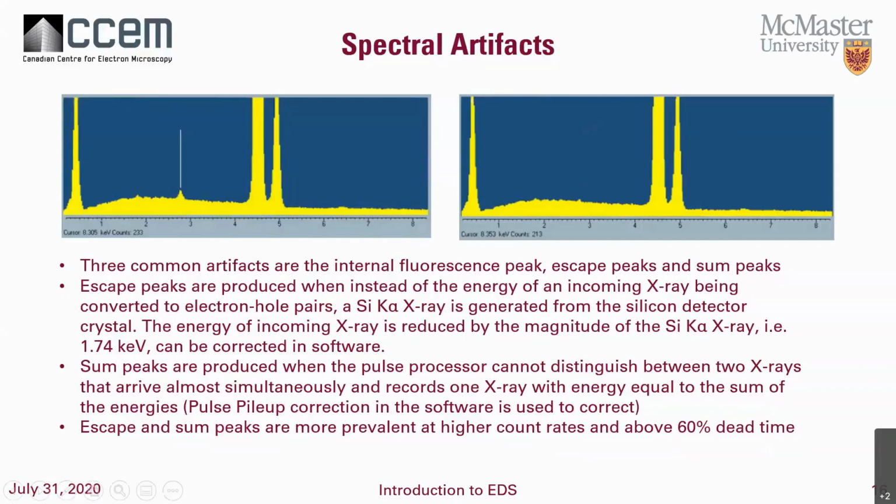And this case is with it uncorrected. It's not 100% corrected by the system. So this is an older system. There has been some improvement in the newer systems.